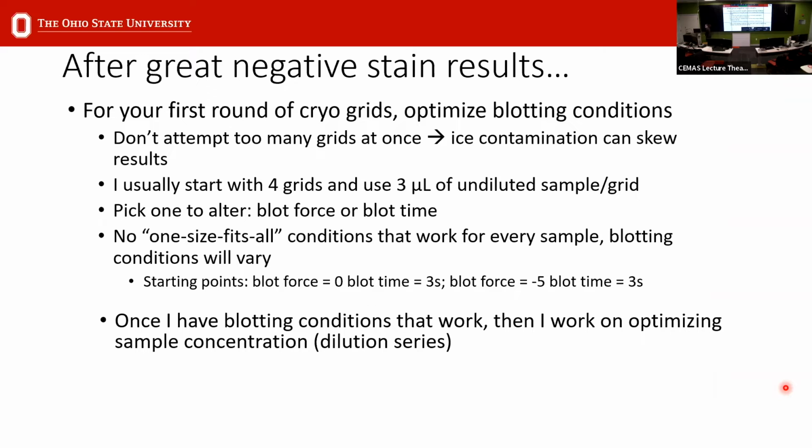For the first round, I don't make too many grids at once. The longer time you spend trying to freeze your grids and clip your grids, the longer they're exposed to air, and this can lead to ice contamination, particularly if you're new to Cryo-EM. So if you're new to Cryo-EM, you're still learning how to handle grids and how to work under cryo conditions, I recommend starting small. Main reason is to eliminate ice contamination.